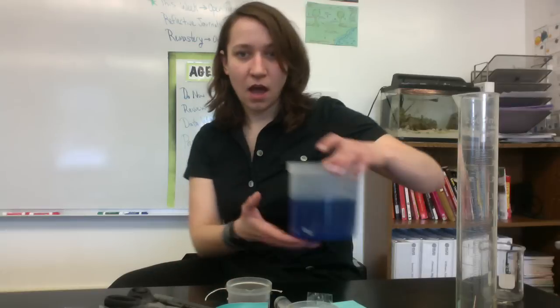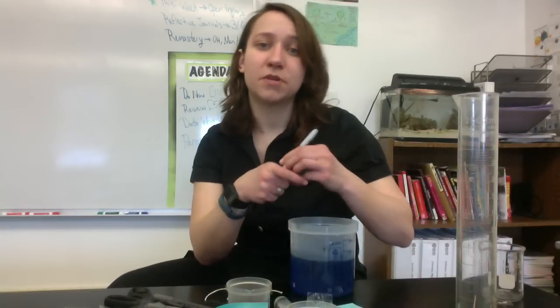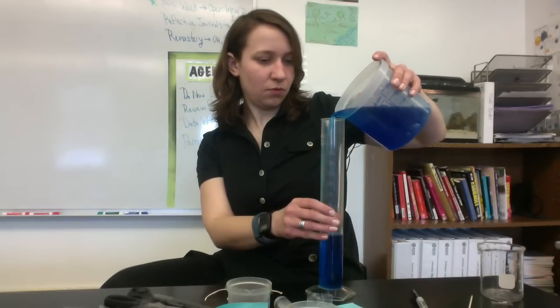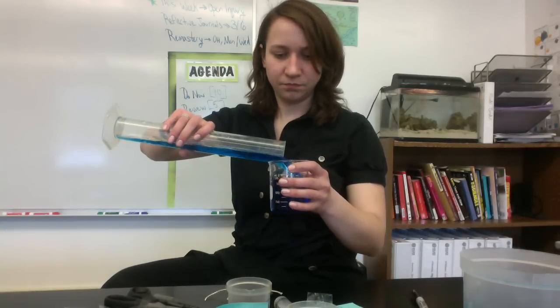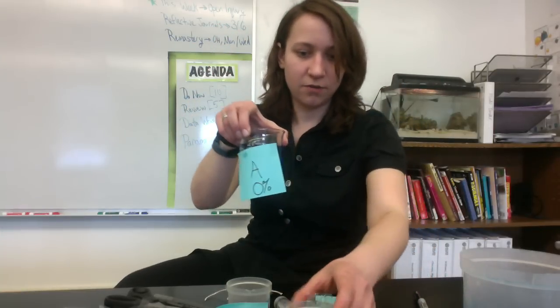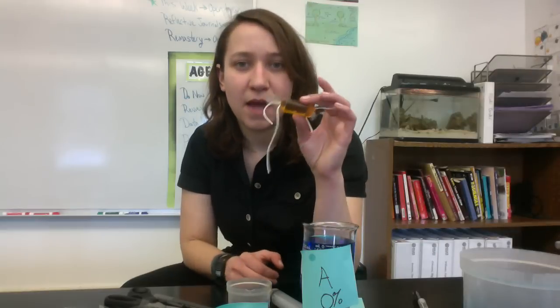Then I'm going to take a solution with a known concentration — let's say solution A, which has 0% sucrose. I'm going to measure 200 mL of that solution and pour it into a beaker. And then of course I'm going to label it. So now I have my unknown solution with a label on it. I'm going to take the initial mass of each of my four little miniature artificial cells — what mass of fluid is inside these right now?